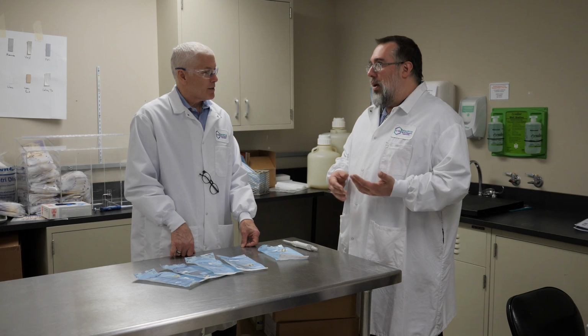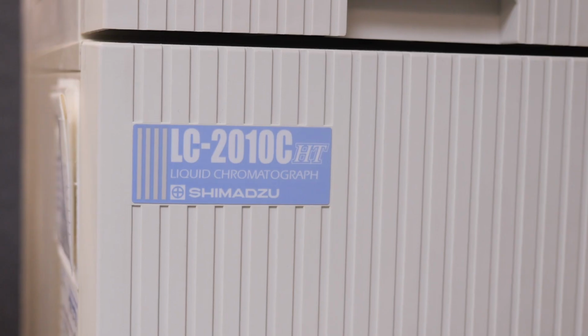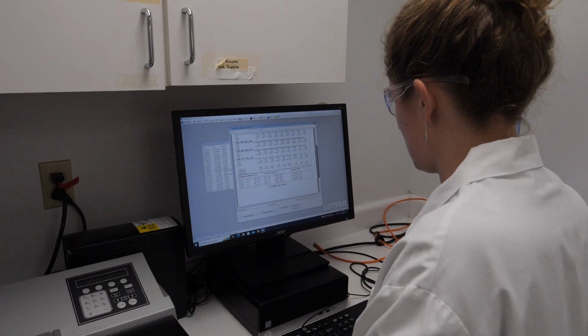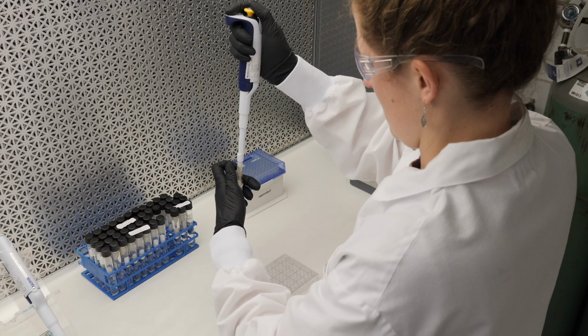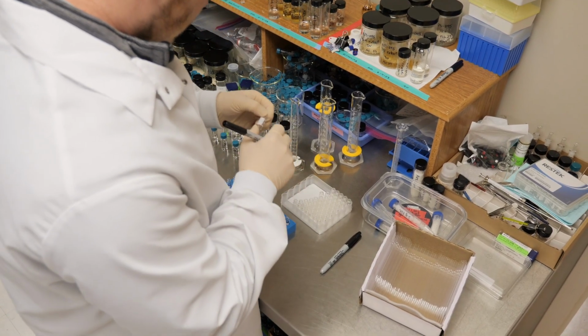We would try to first recover the organism on the surface of those coupons to ensure that there's no interaction there. And then we also have to test out the neutralization of all the disinfectants to make sure that we're properly recovering any leftover organisms that might be still available after the disinfectant goes to work. If it is not successful, you will need to find an alternative to that disinfectant to use in your facility, and we would be happy to assist you in determining which disinfectants would be effective in your facility.